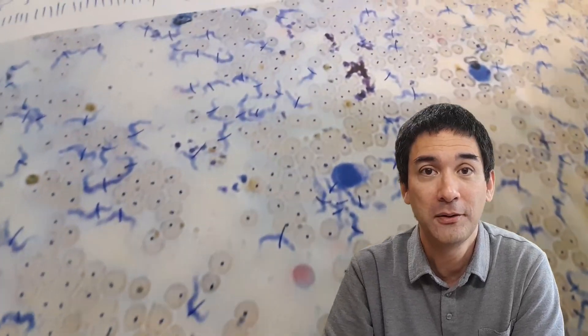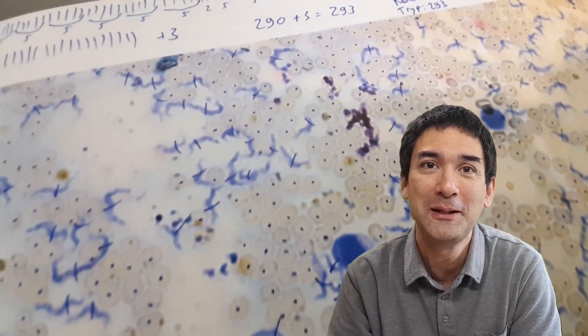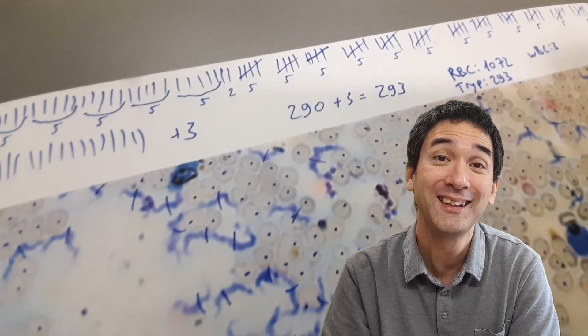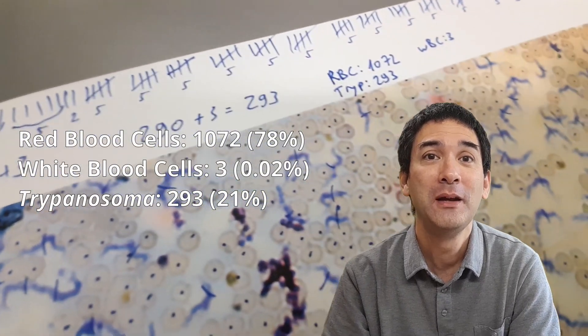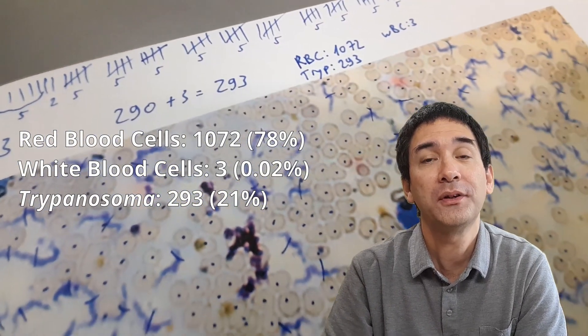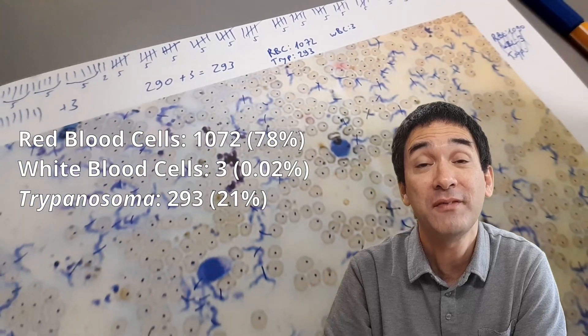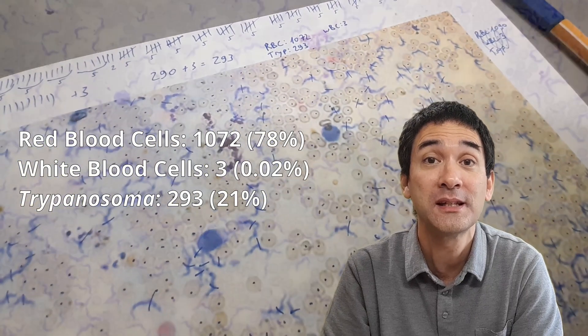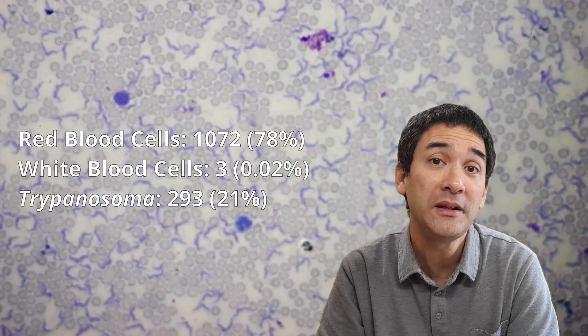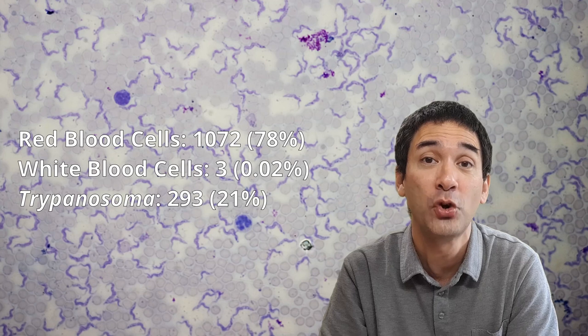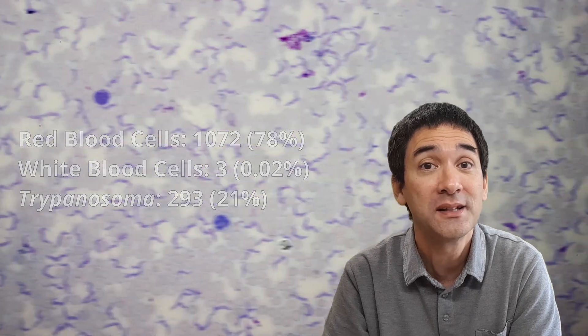After about 15 or 20 minutes and a little bit of math, I was able to determine that about 78% are red blood cells and about 21% are those trypanosomas. The number of white blood cells is far less than 1%, which is what we would actually also expect — the number of white blood cells is significantly lower than the number of red blood cells.